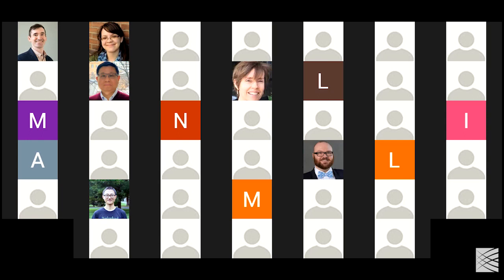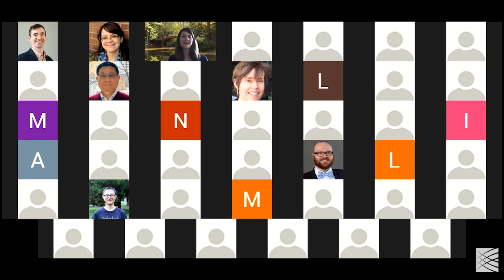Okay, we're going to get started now with the next section of today's presentation, specifically workflows. So I'm going to go ahead, turn on my video again. Before I jump off into the next section, again, were there any other questions that people wanted to ask? Did you run into any issues launching any of the workflows or uploading data tables, or have any questions about just working with cloud files in general?